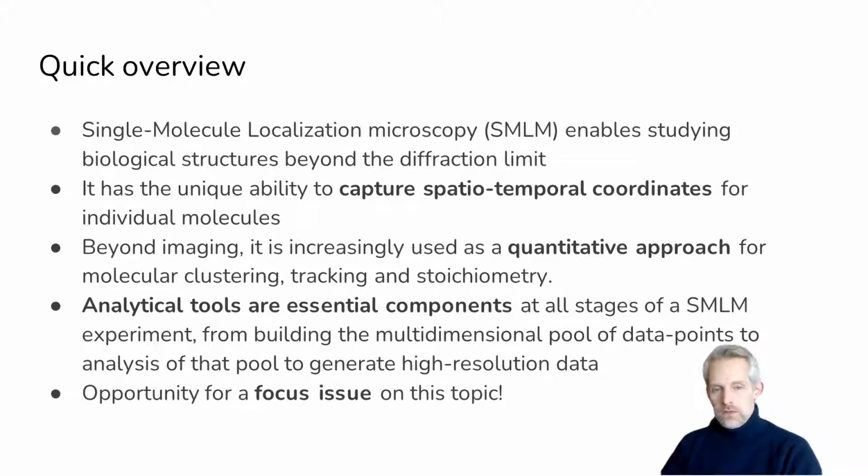Analytical tools are therefore essential components at all stages of a single molecule localization microscopy experiment, from building the multidimensional pool of data points to the analysis of that pool to generate high-resolution data. So we saw this as an opportunity for a focus issue on the topic.